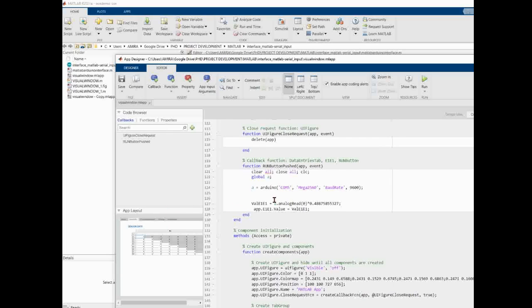This part here is where I call the functions of those cells that I showed earlier, and I call this under the run button, because when you press the run button, it will initiate the whole process. So it will start from the transmitting and receiving electrode, of course, but I skip that part first because I just want to get the measurement first, whether I can obtain the measurements from the Arduino and display it on the App Designer MATLAB.